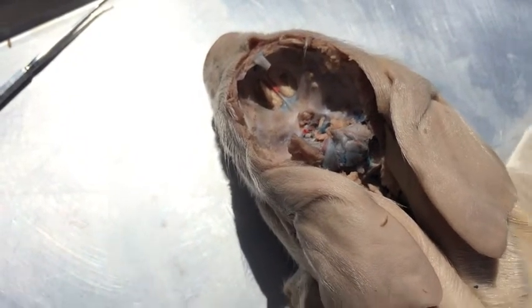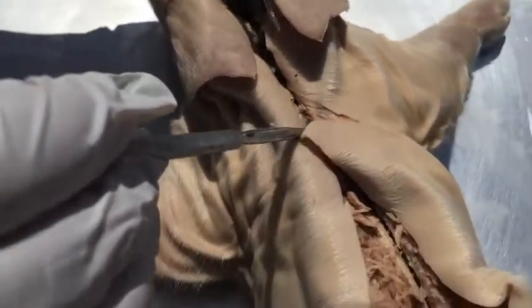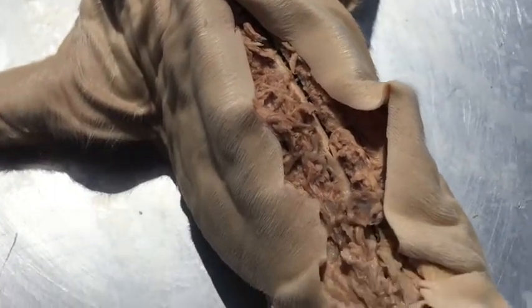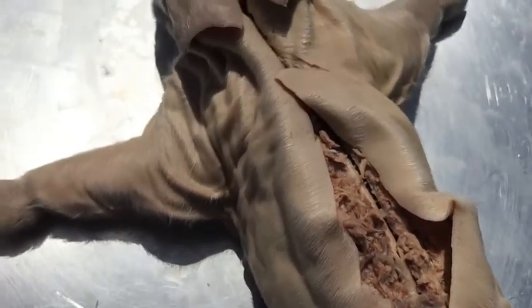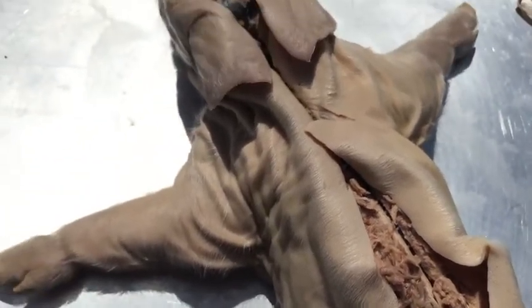Next we have the spinal cord, which is down on the inside of the pig, down all across there, all the way down the pig. And basically what that is responsible for is extending from the brainstem through the vertebral canal, and giving the pig its structure and shape so it can stand up straight, so it can be on all fours and hold up its back.